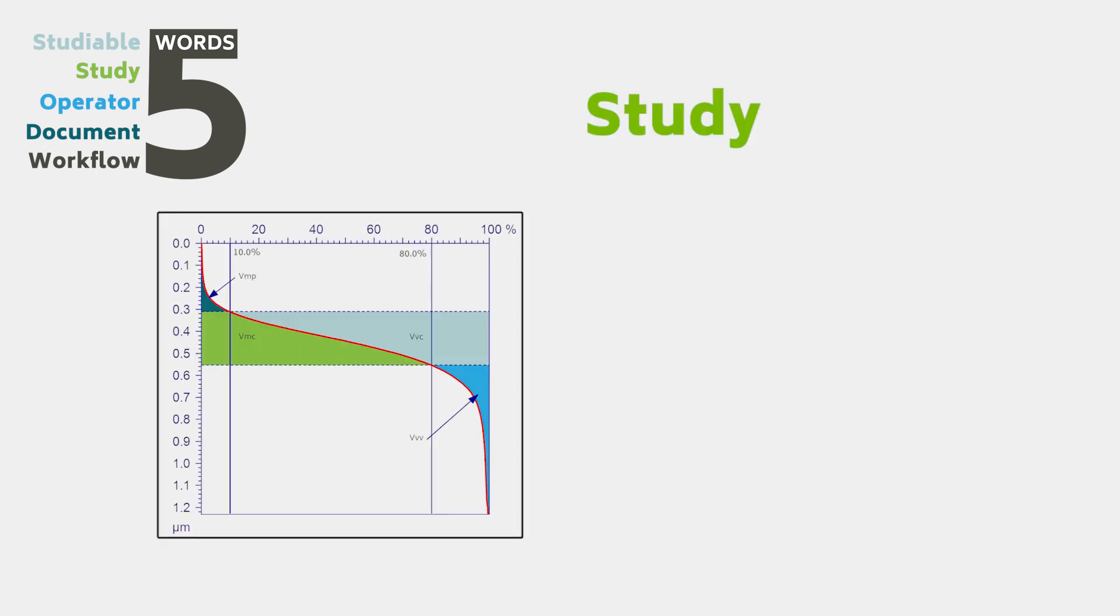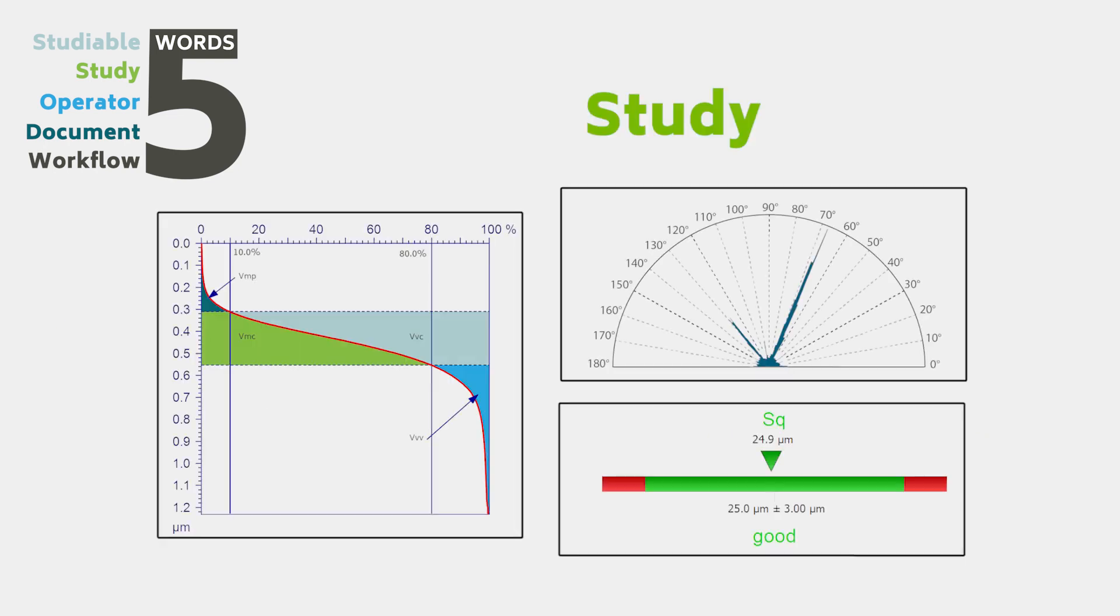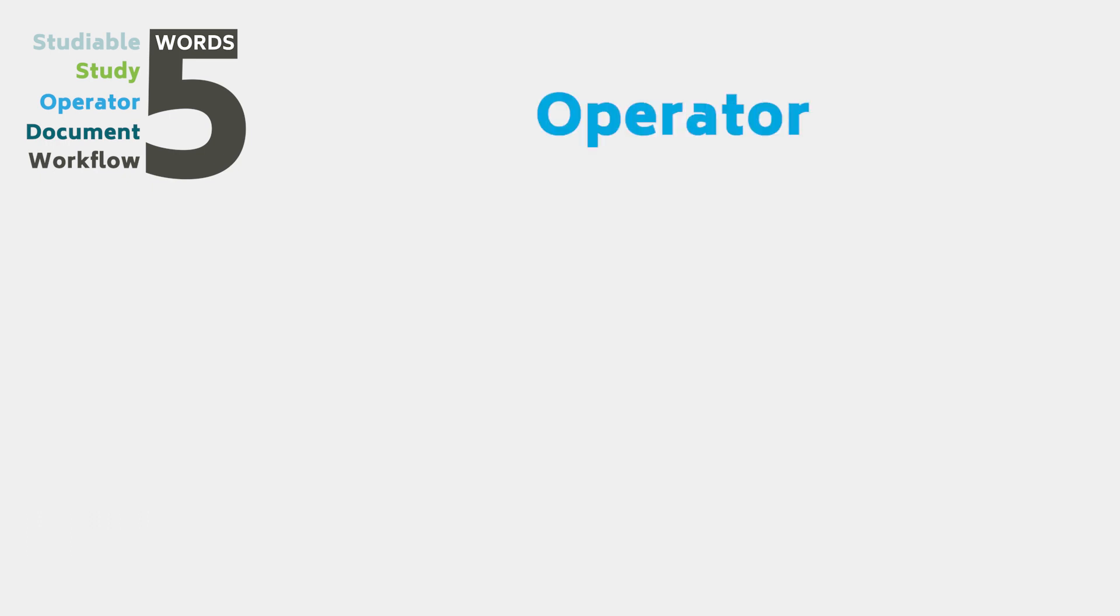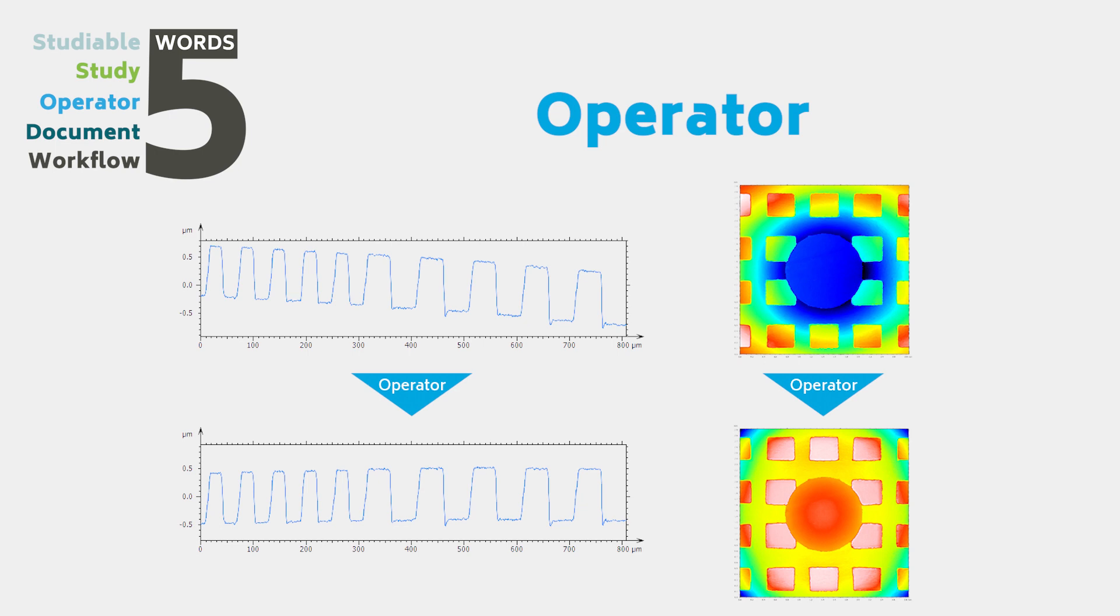A study is a frame in the document which displays data or analysis routines applied to data. An operator is a tool used to modify a studyable.